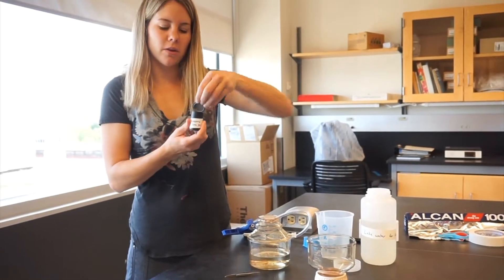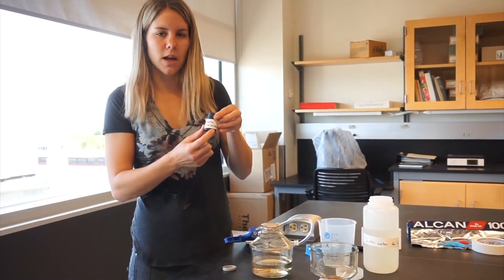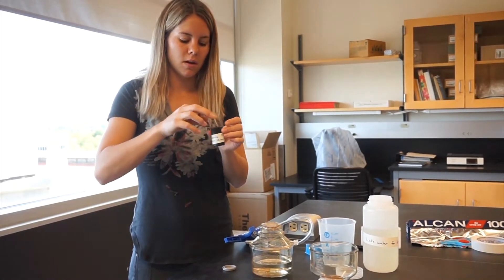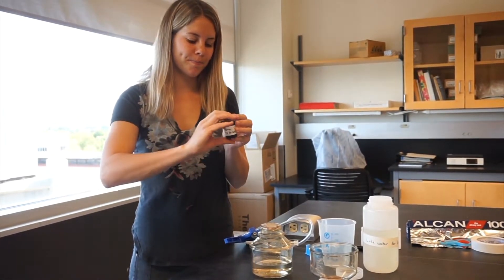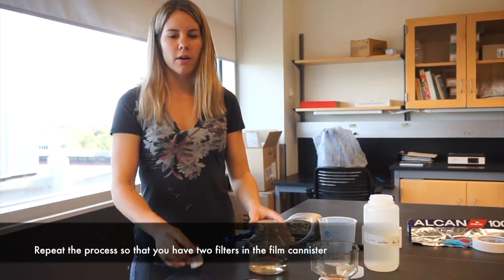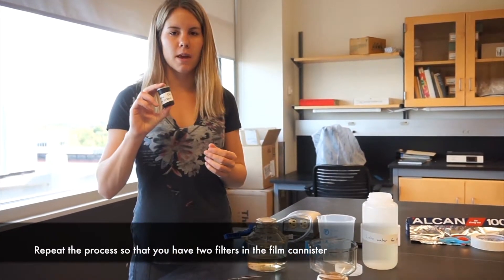You should have a film canister that you've labelled with lake, date, and chlorophyll, as well as the words citizen science. Your foil can go in there. Then you'll run through this one more time so that you have two foils in the same film canister.